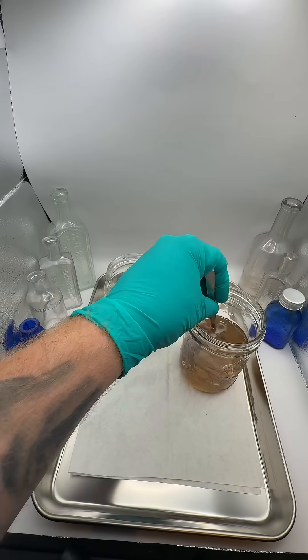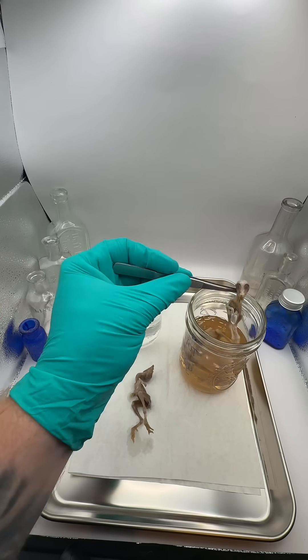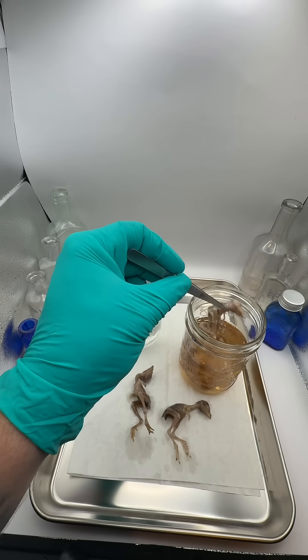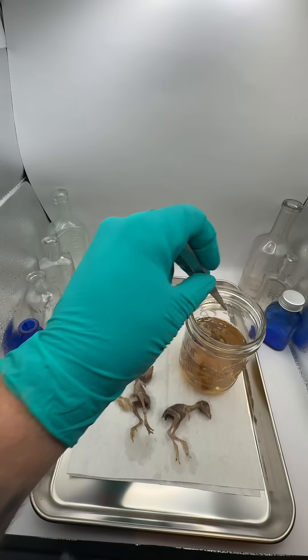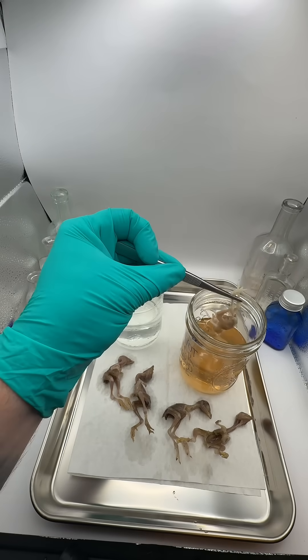After 96 hours in the 10% formalin, I transferred the specimens into the first of two 24-hour water baths. From what I could find online, baby quail should only require up to 72 hours in formalin. Life is busy, so they got an extra 24 hours than they may have required — so hopefully that means they are good and ready for this next step.